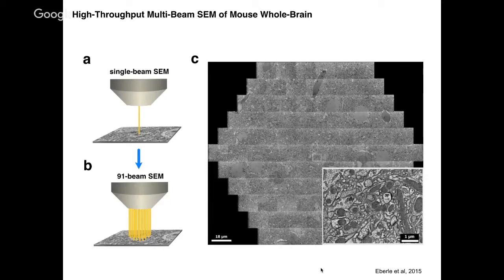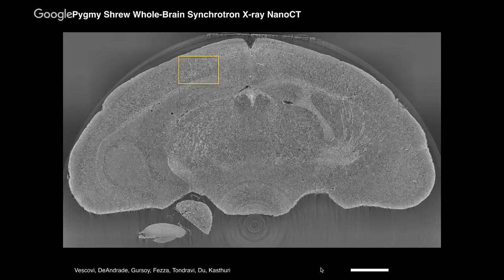Now, I've sort of gone through the EM. I don't have that much time, so I want to just quickly say something about the Nano-CT. So I promised to explain the relation between the two. If you have a sample that is suitable for EM, meaning it has high metals content in it, it means that X-rays will also interact with those metals, and you can use such a sample for X-rays without any problem.